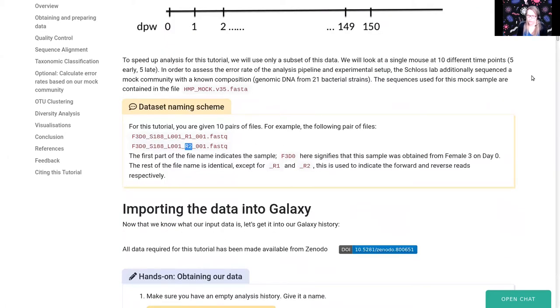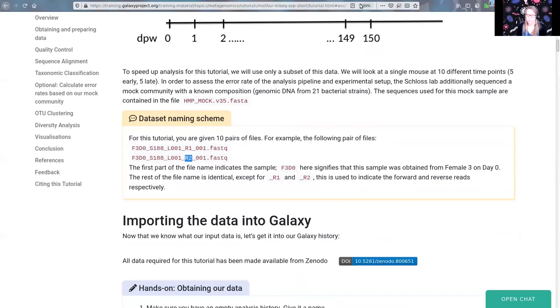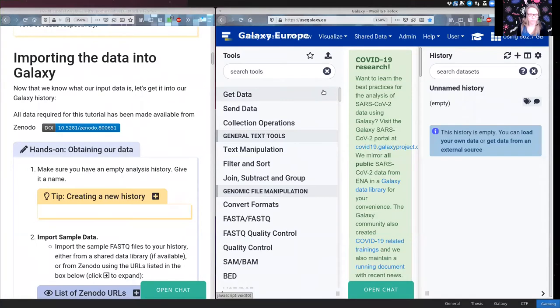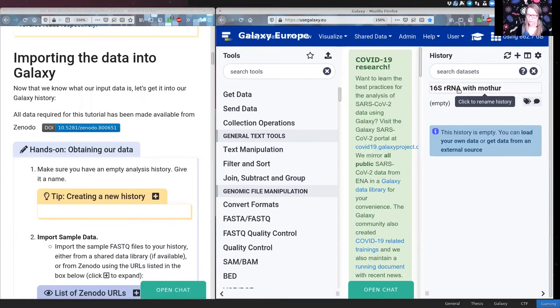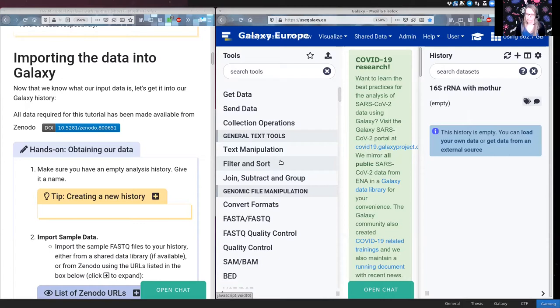Let's start importing our data into Galaxy. First make sure you have a new history — if your history is not empty, click the plus icon at the top to start a new history and give it a name you can remember, like '16S rRNA', then hit enter. We are going to take 20 samples — 10 early time points and 10 late time points — and since these are paired-end sequences with two files per sample, we have 40 files in total.